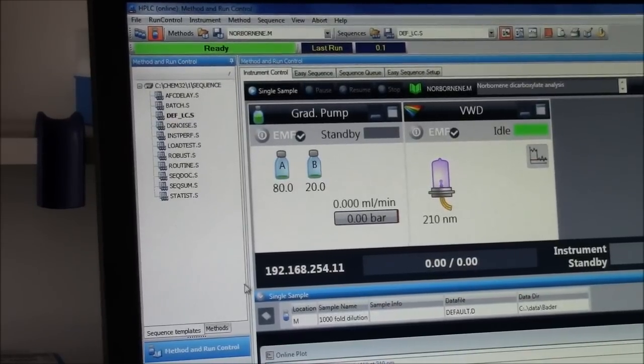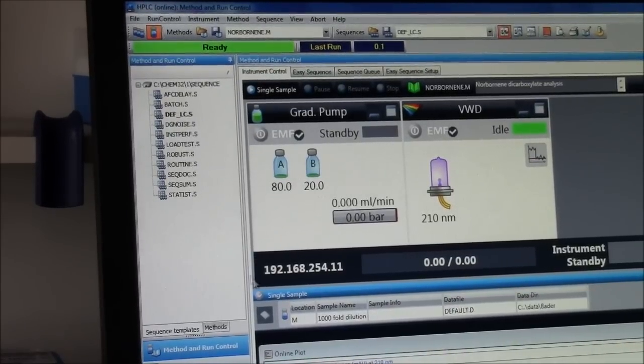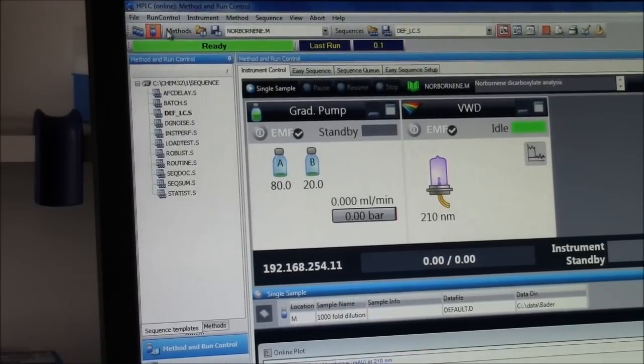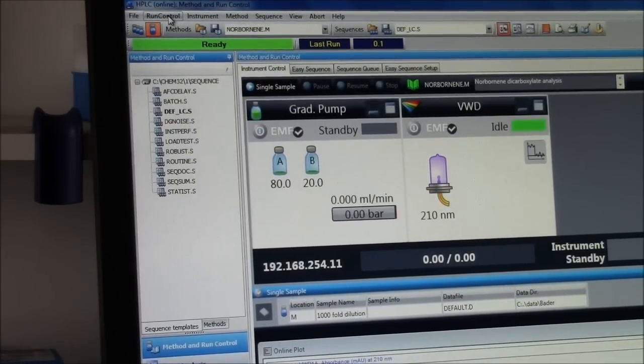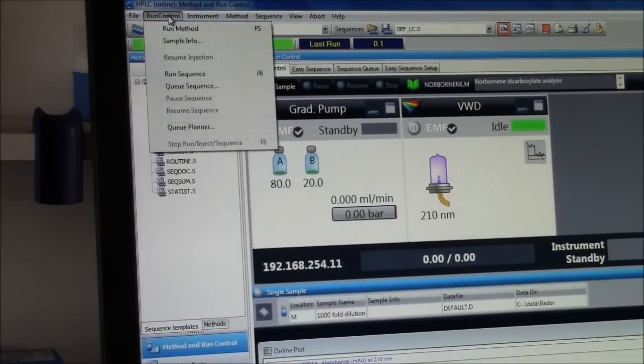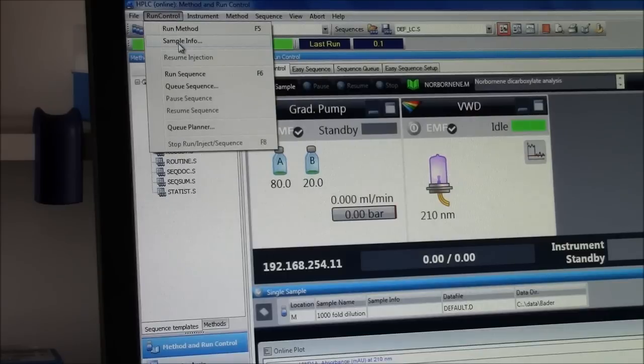I am going to run a sample on the HPLC. I start here with run control, sample info.